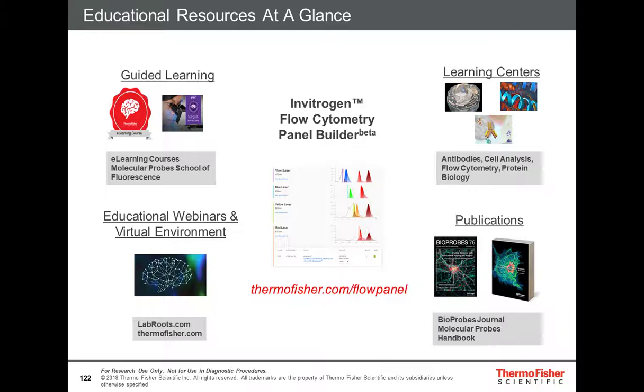I think it's called Unraveling the Immune System 17-Color Flow Cytometry. And it has a bit of an easier math equation that looks at the spreading. And you can use that equation to generate a matrix by hand. We certainly did that before FlowJo was able to do the math. So yeah, you can do a matrix, or you can even take the matrix in either one of those papers and use it as a general guide.